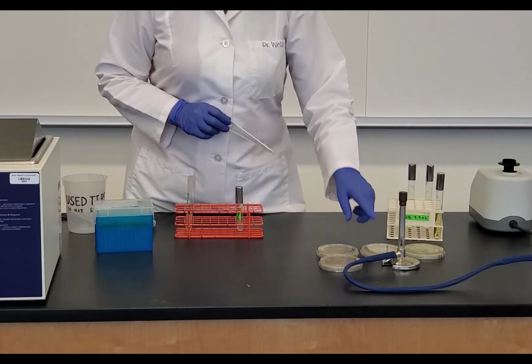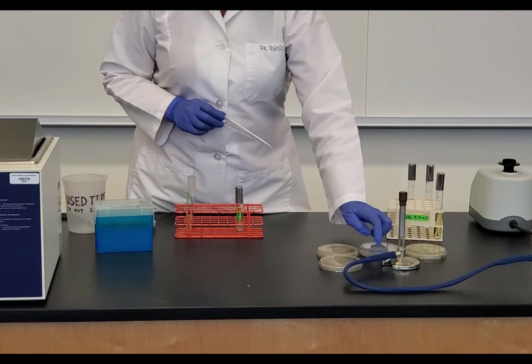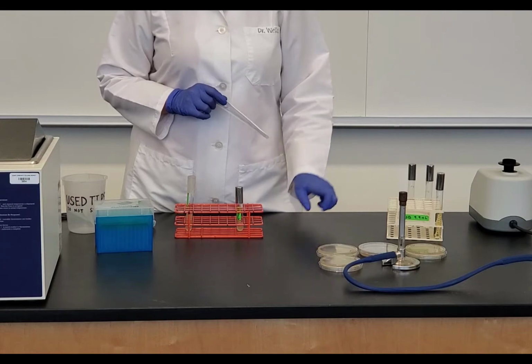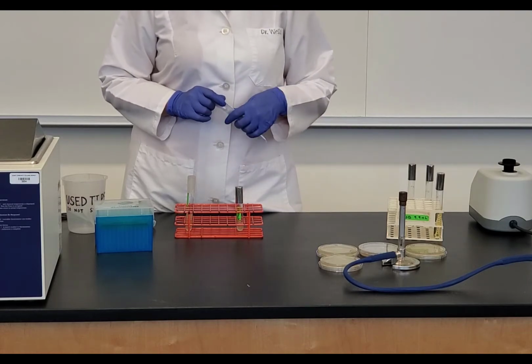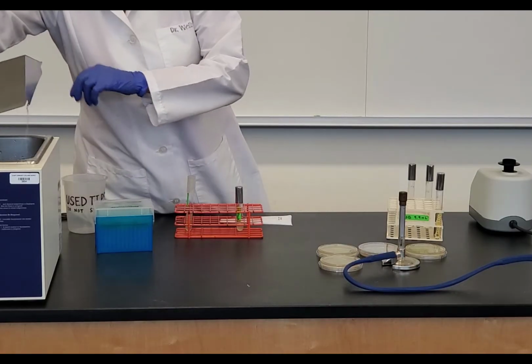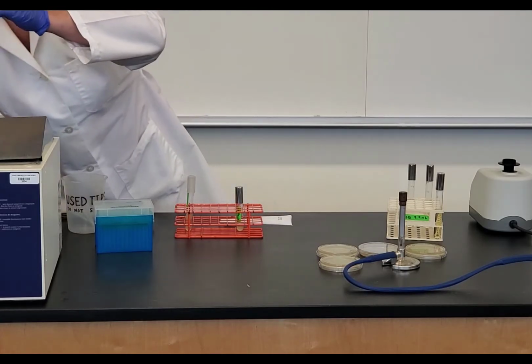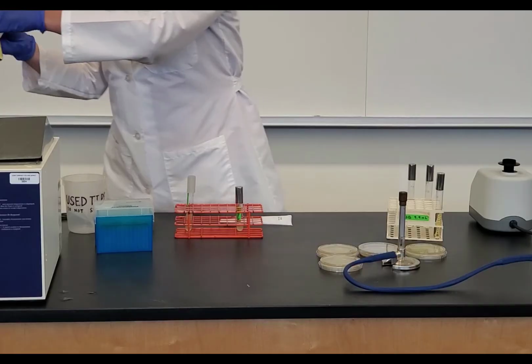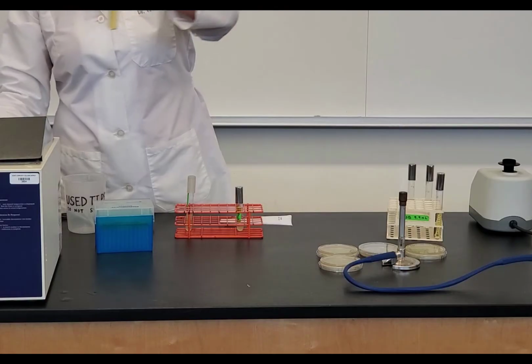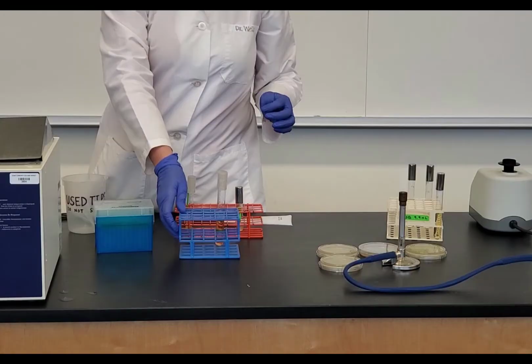In addition, the first one that I'm going to do is my 10 to the negative 5. I'm going to turn this one so that the agar side is down, so that I'm pouring the liquid on top of the agar that's already in there. I don't want to pour the liquid into the lid. So I'm ready now, and I'm going to take out one of my melted agar deeps. I'm just going to wipe off some of the excess water from the water bath, just so it doesn't drip all over. So this is my melted agar deep, and I'm going to put this here.